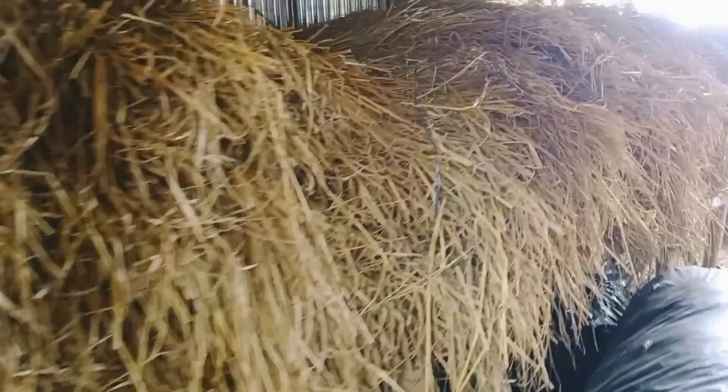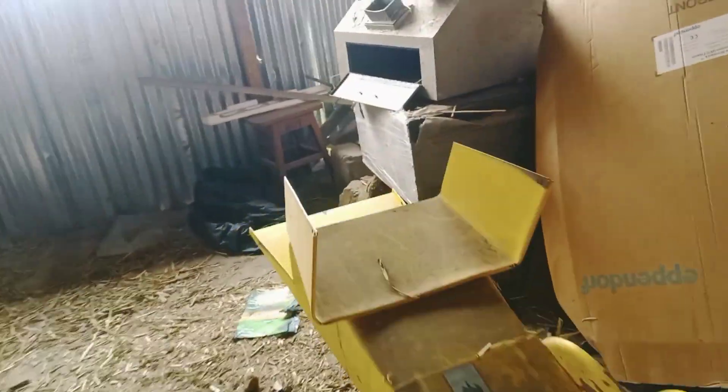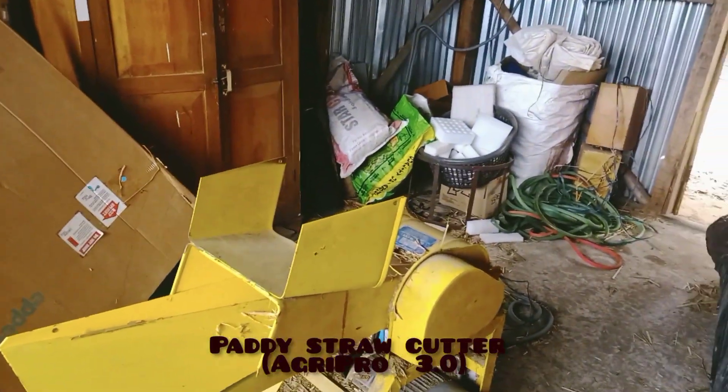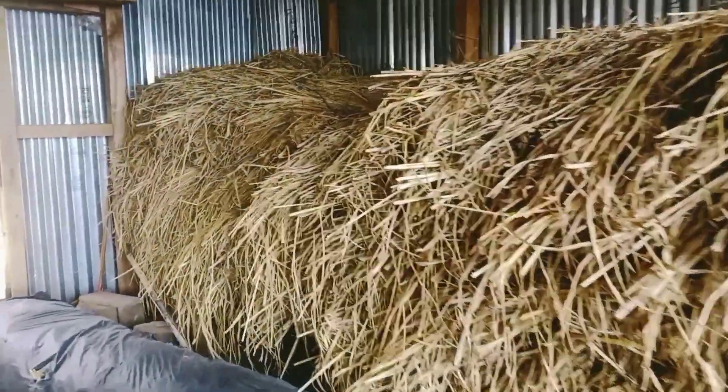These are the paddy straws collected by the Botany Department of Fazal Lake College for mushroom cultivation for our vocational courses. This is a paddy straw cutter for cutting down the straws. Today we are going to start our practical of mushroom cultivation for BSc 6th semester at Fazal Lake College.